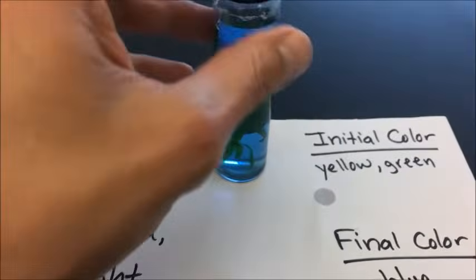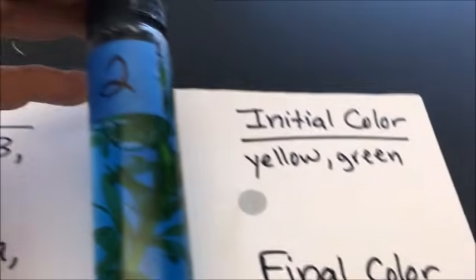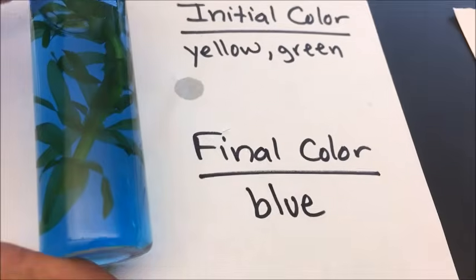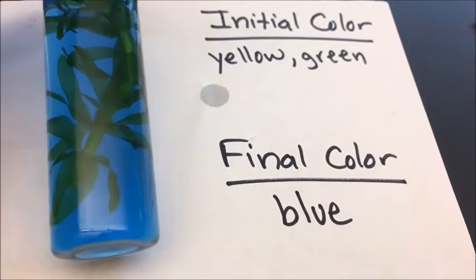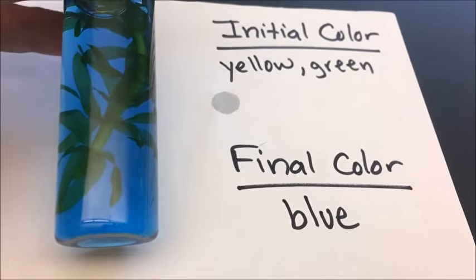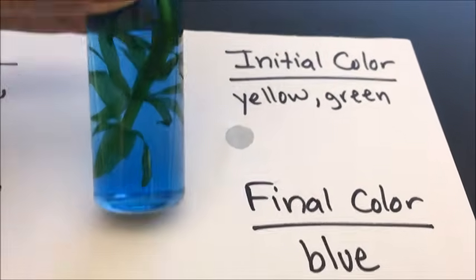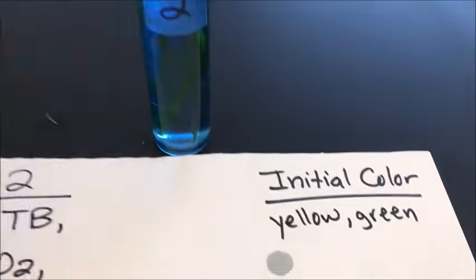What about tube number 2? Notice tube number 2 was initially a yellowish green color, but the liquid inside has clearly gone back to being blue in color. So a pretty substantial color change has happened. Hopefully you'll be able to explain why that occurred.